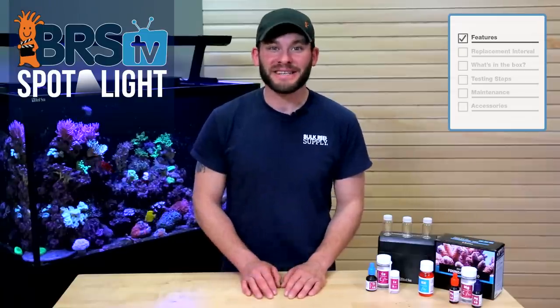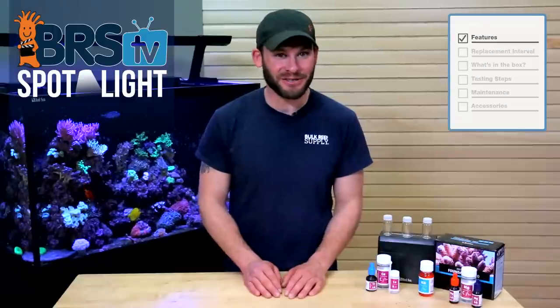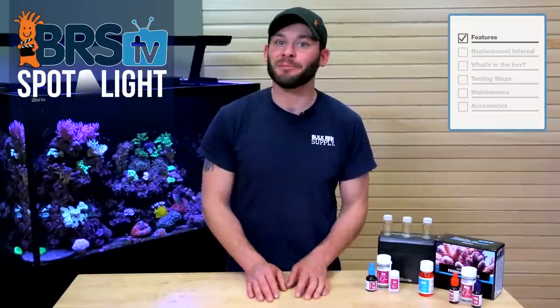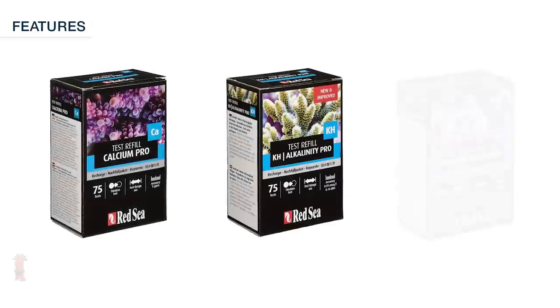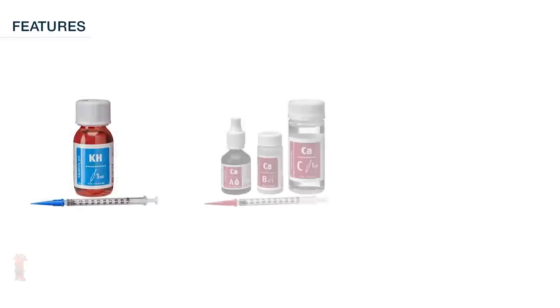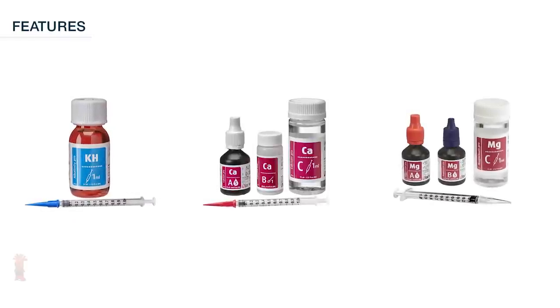Each Foundation Pro test comes with enough reagents and titration solutions to conduct 75 tests, and depending on your testing habits could potentially last you a couple months or even longer. Rather than having to purchase a completely new kit when your tests run out, Red Sea offers very affordable reagent refills, each coming in at under $17, and they include the liquid and powder refills as well as replacement syringes.